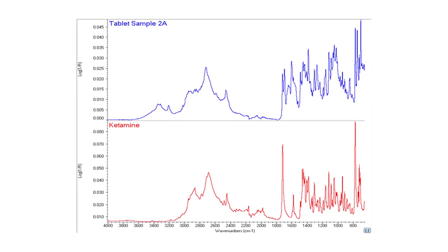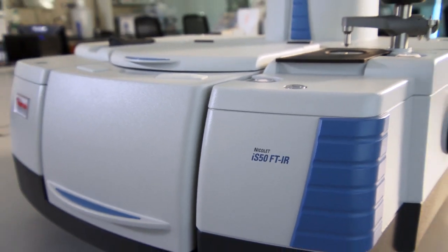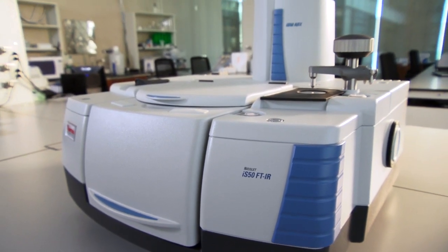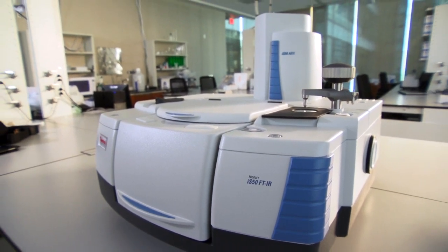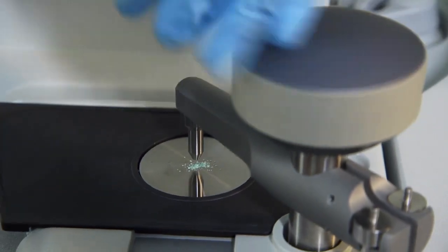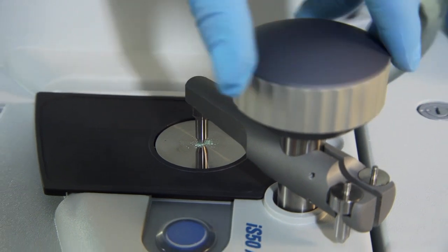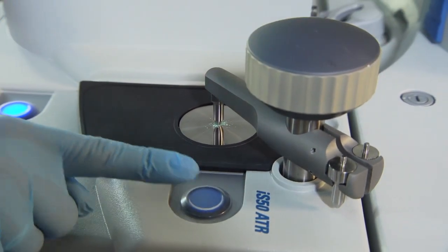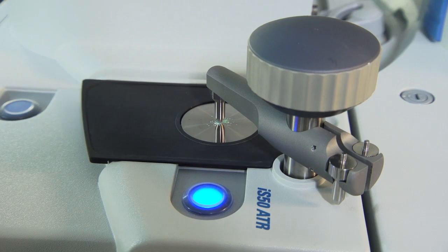That's why the new Thermo Scientific Nicolet IS50 FTIR spectrometer, with its combination of technological sophistication, analytical flexibility, and ease of use, is the ultimate forensics analysis workstation.